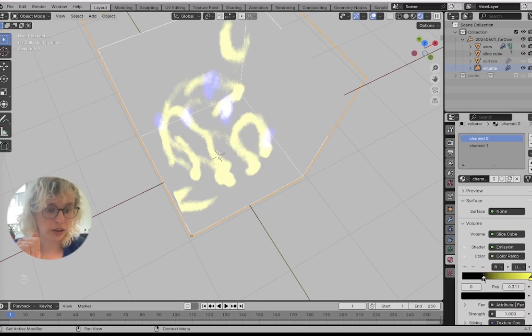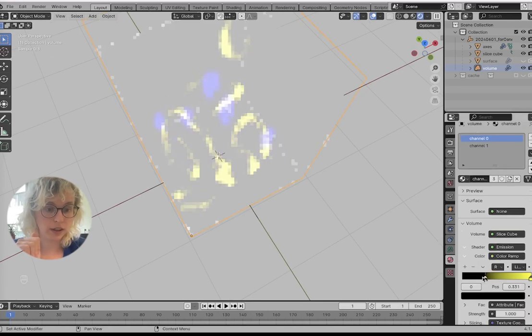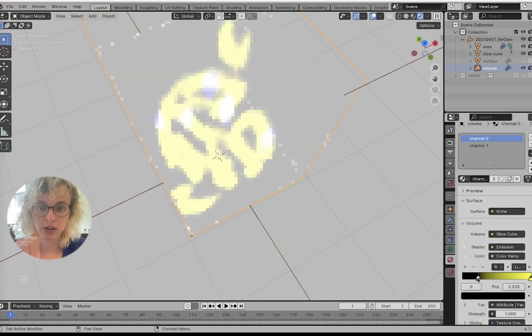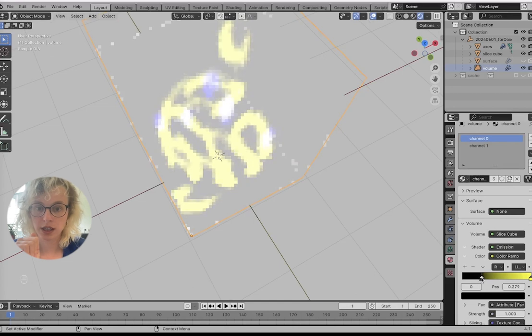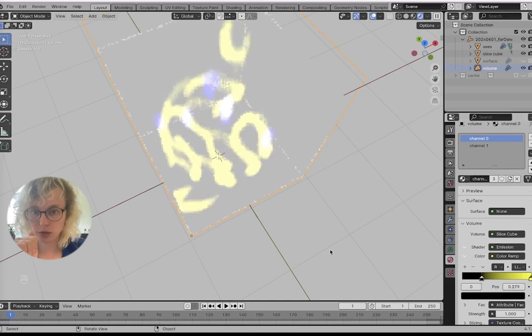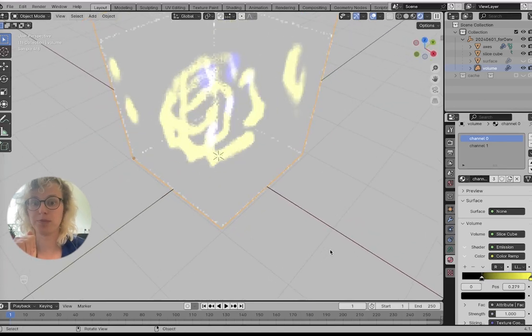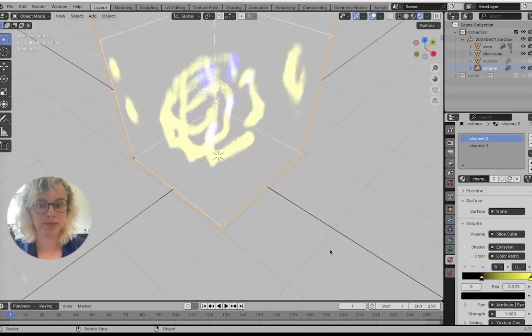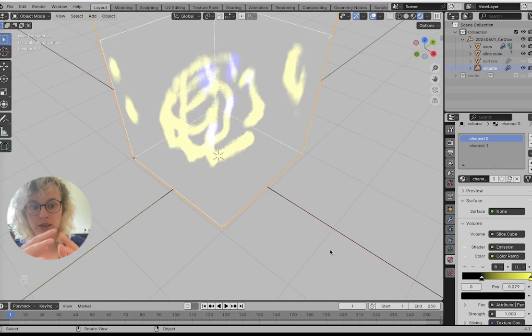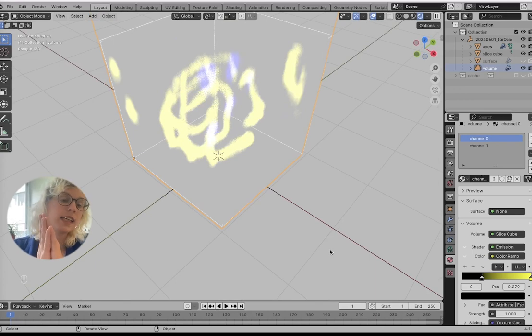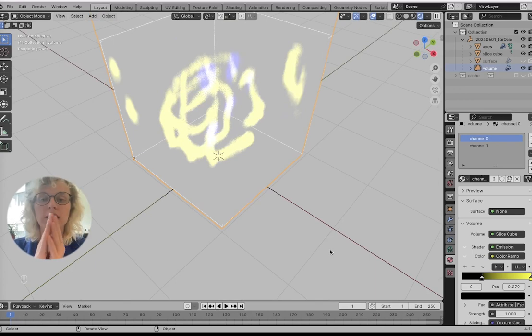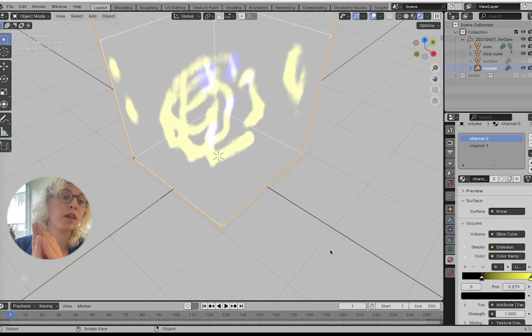For channel zero, we can do the same thing and see how we want to threshold our data. So that's the easiest way to quickly change your thresholding.